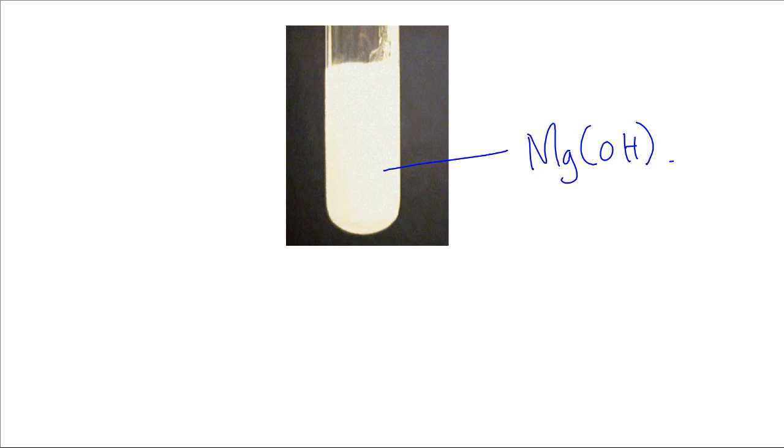The second one, let us look at addition on barium ion solution, maybe barium chloride, which is a solution containing barium ion. So we'll have few drops, or simply dropwise, and then excess.